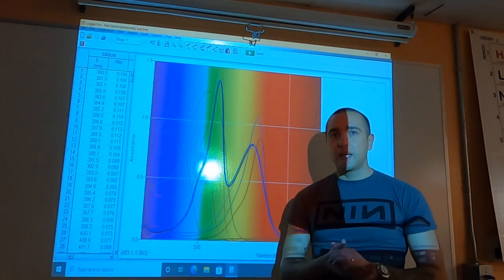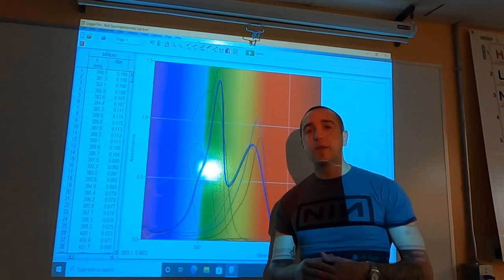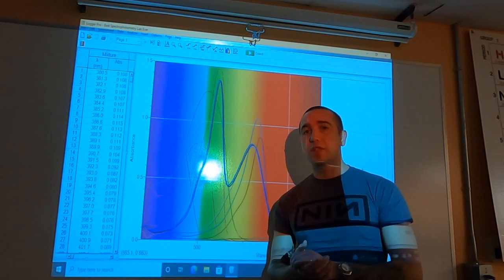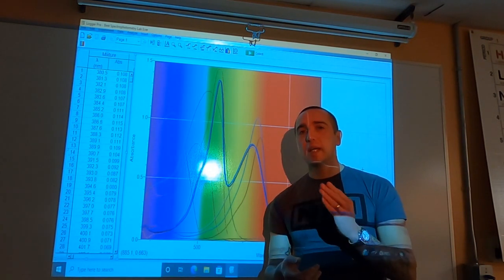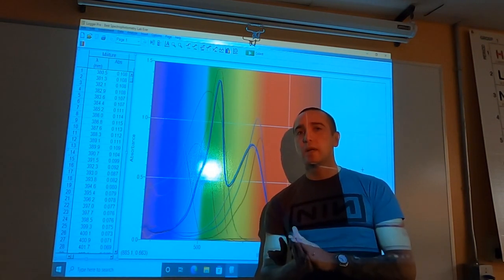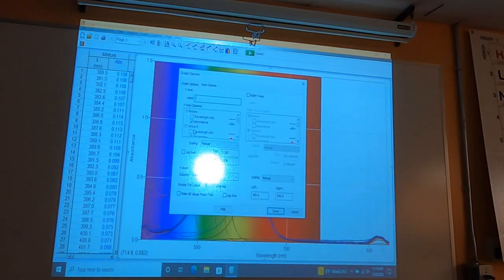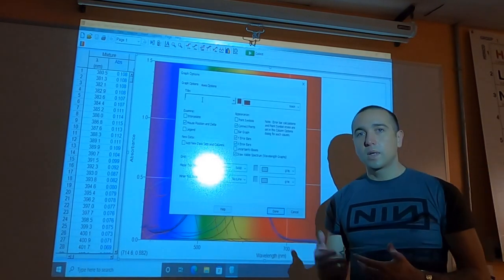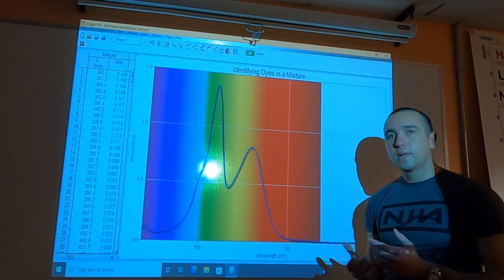Now what you're going to do is if you right click on the background of the graph, it's going to give you graph options and you can change what is being graphed. You can change which data sets there are so you can compare them better. You'll always want to keep your mixture up and then you'll go through each known dye one at a time to see which peaks in the mixture are being accounted for by which dyes were in them. While you're here, you might as well title your graph as well.